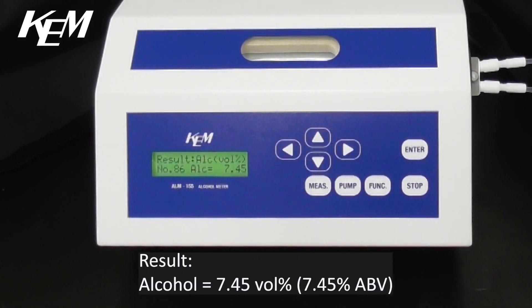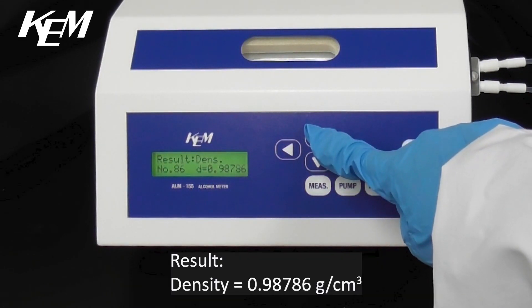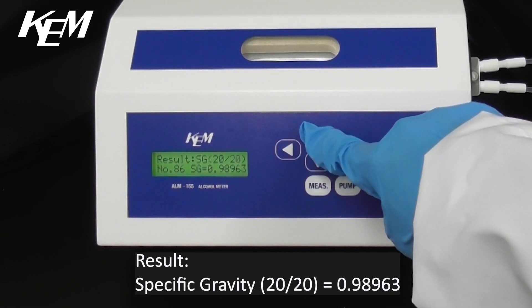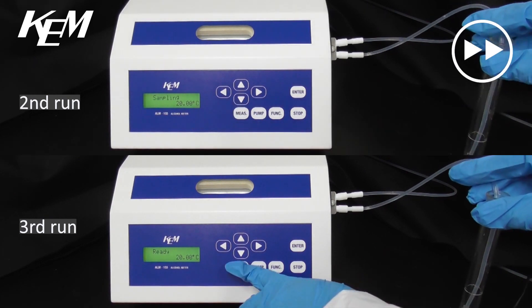Result for alcohol: 7.45% alcohol by volume. Density is 0.98786 grams per cubic centimeter and specific gravity is 0.98963. In total we will measure the sample in triplicate to confirm the repeatability of measurement.